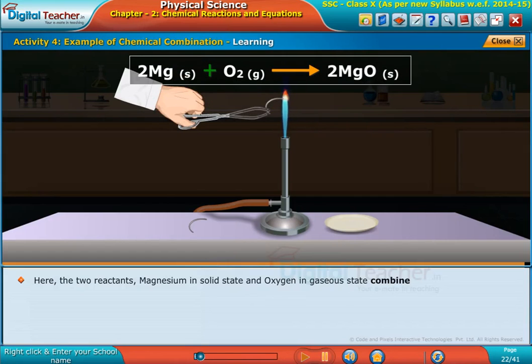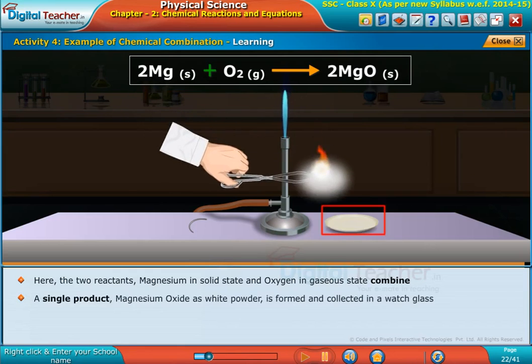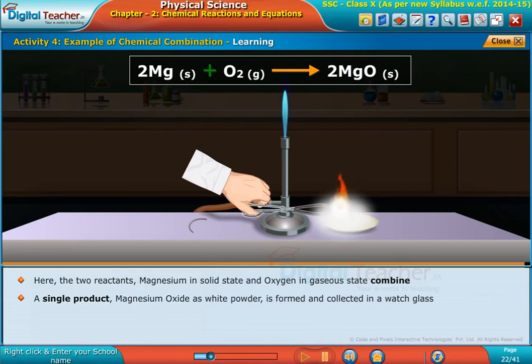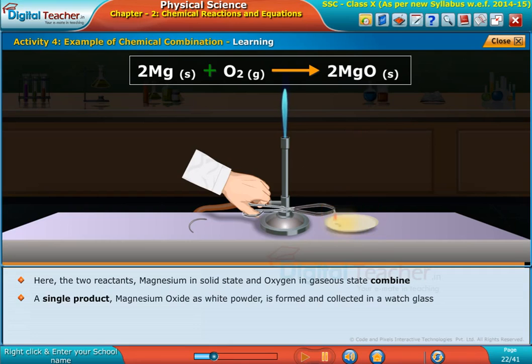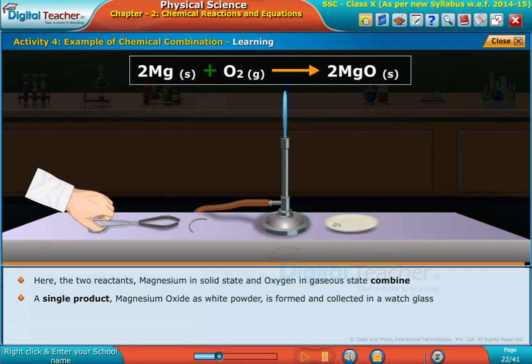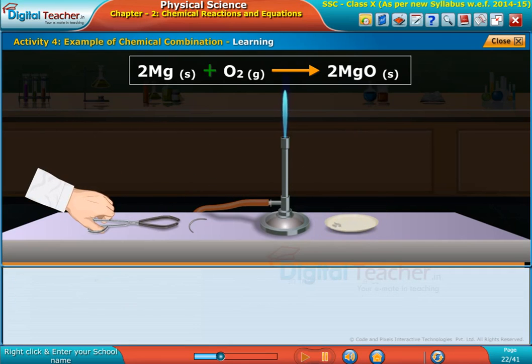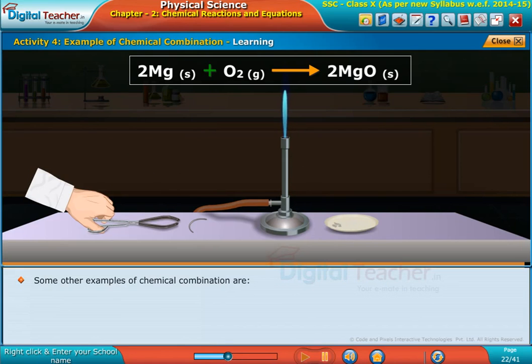Here, the two reactants — magnesium in solid state and oxygen in gaseous state — combine to form a single product, magnesium oxide, as a white powder collected in a watch glass. Some other examples of chemical combination are shown on screen along with their respective equations.